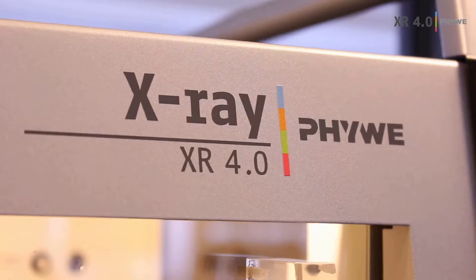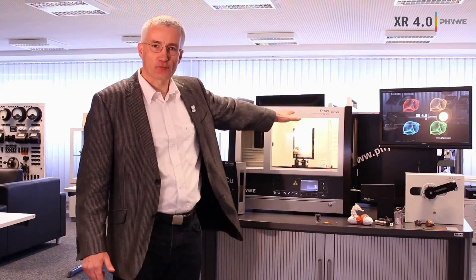The company is now more than 100 years old and this is our fourth generation X-ray instruments for teaching. The advantages in teaching are: it's very affordable, it's very versatile, it's very easy to use, and it's also computer assisted.